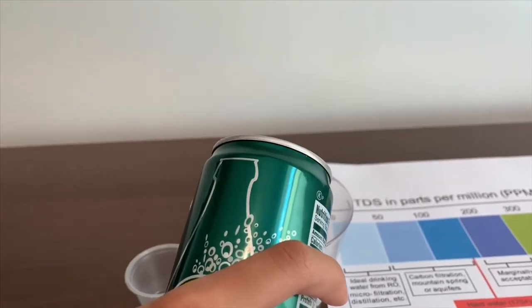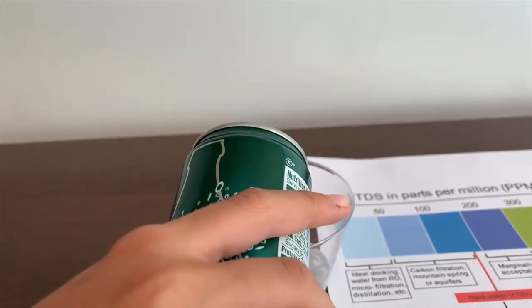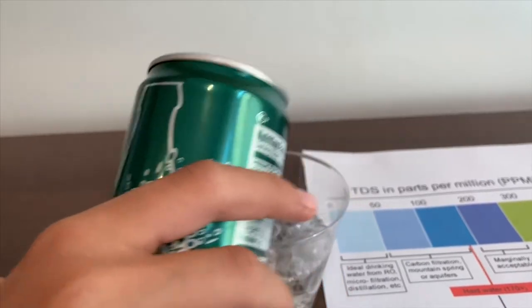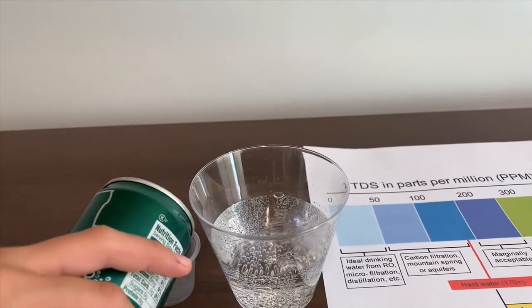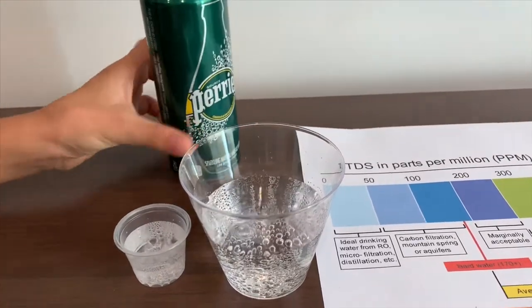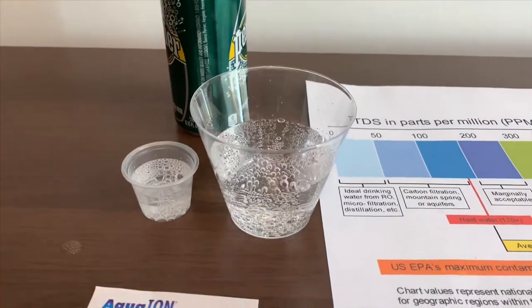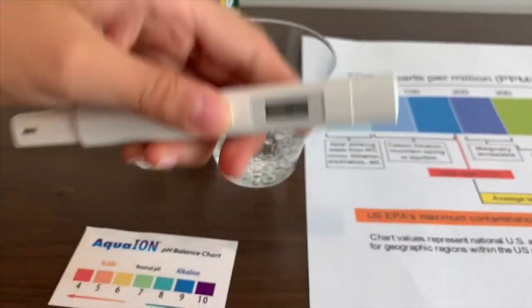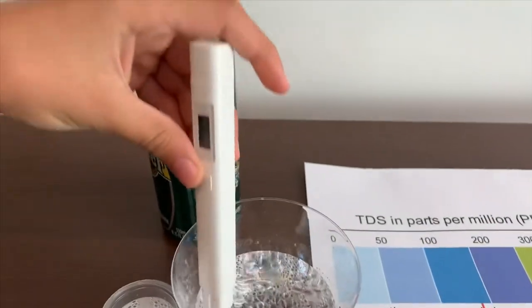Let's pour some in so we can test the TDS level and pH. First let's test the TDS level. Turn on the TDS tester and make sure it says zero. Put it in and let's go.